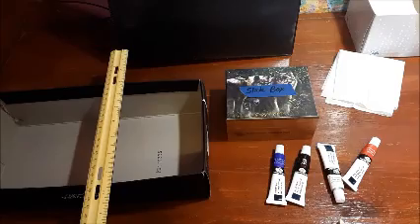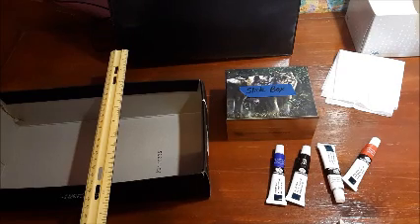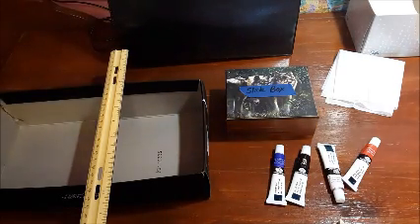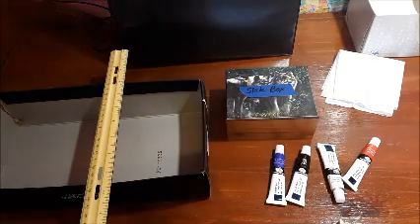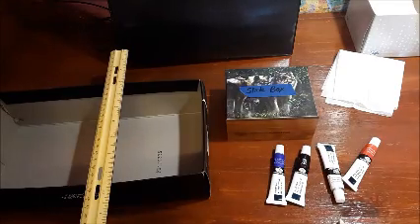And then once your workspace has been cleaned, you can remove your gloves and put them away in the biohazardous waste container as well. Then go and wash your hands, again, very thoroughly. And then once you've washed your hands, put on a new pair of gloves because you're about to start the next experiment, which is your acid-fast staining.